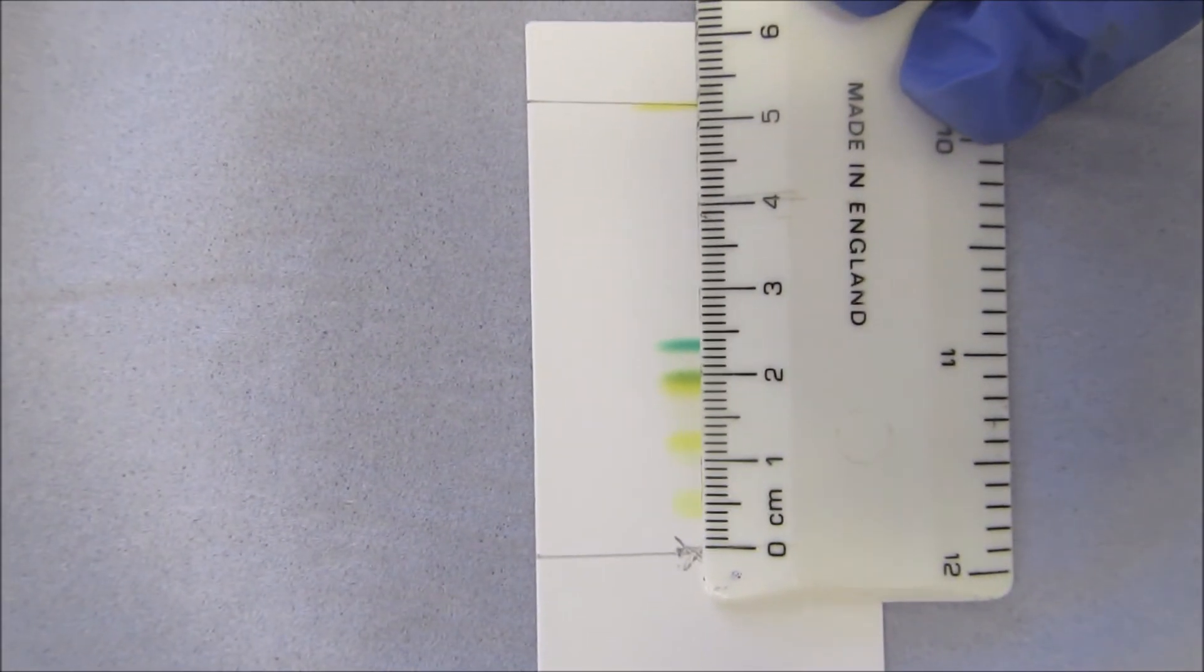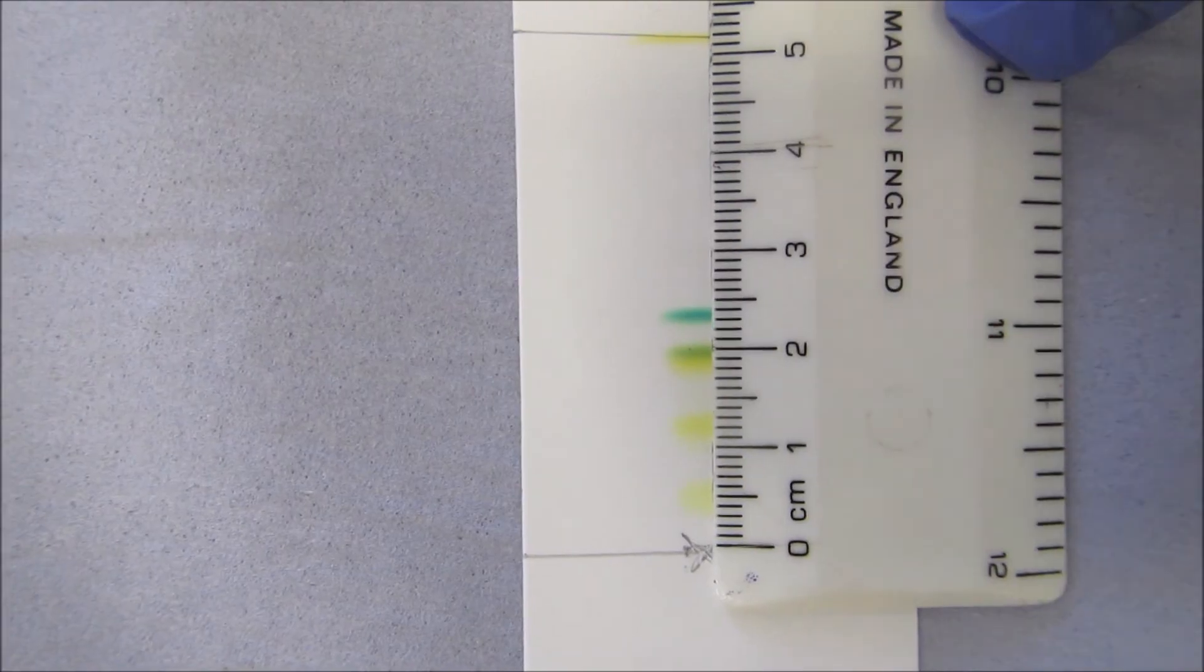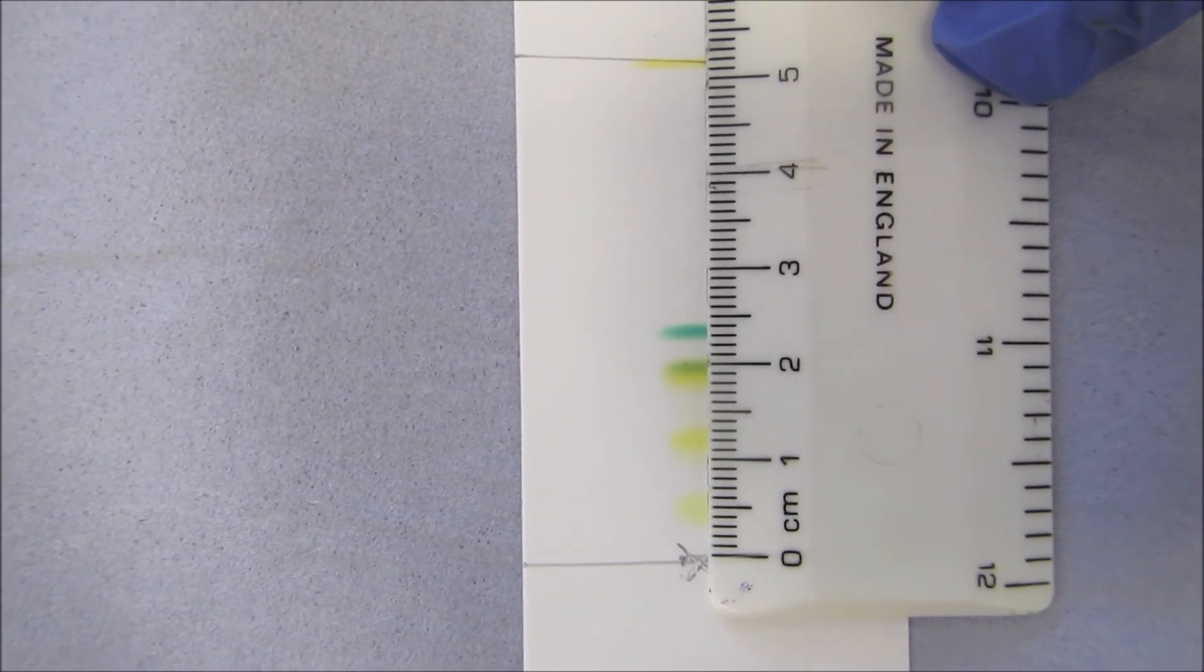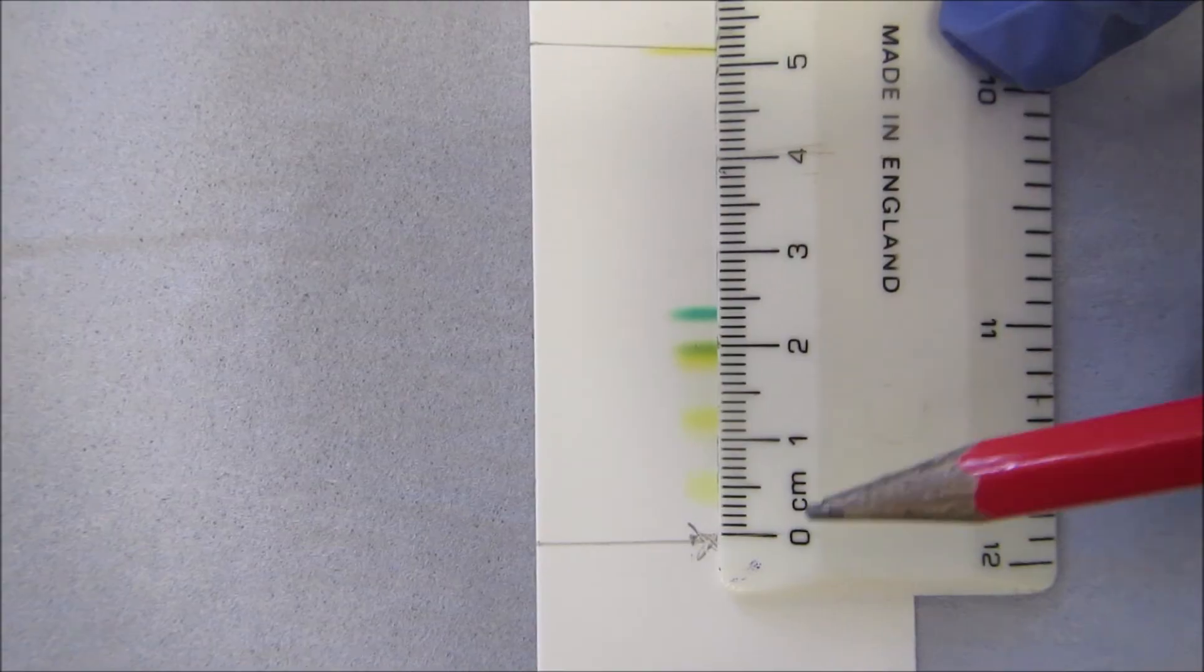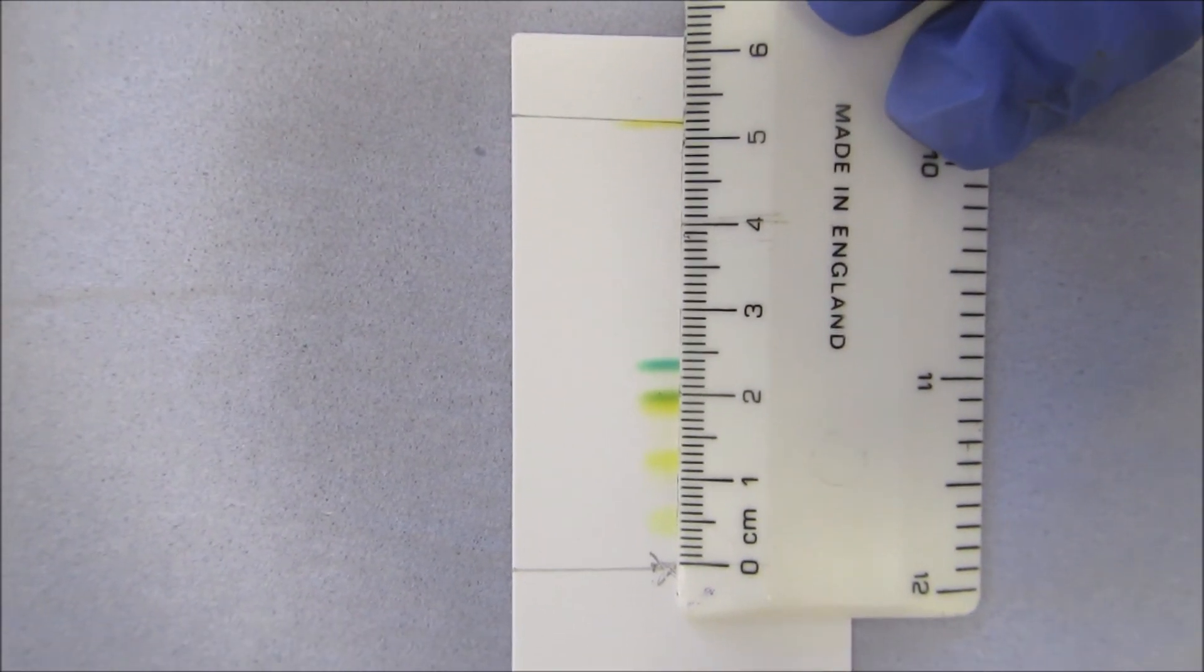From this, you should be able to work out the RF values for each pigment. And then do some research. There's some information on the sheet that might help you to work out what pigment is which.